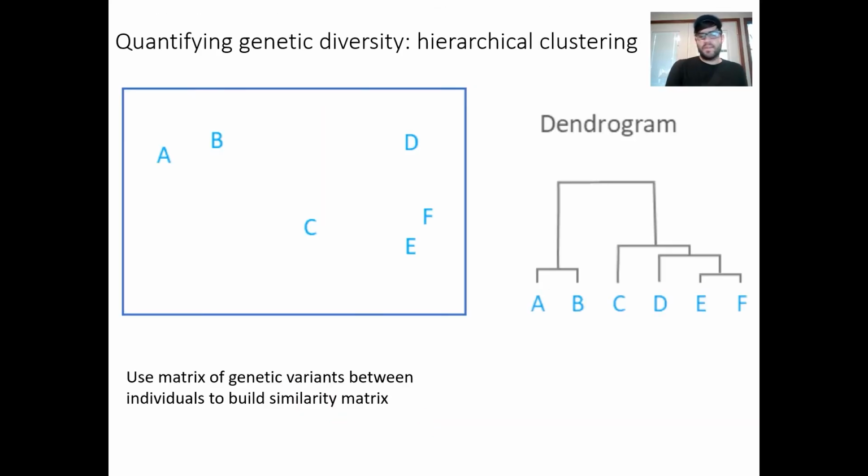And so there are a number of different approaches that we can do here. We can do a principal component analysis, which we will actually run in the notebook associated with this video. We can also run a hierarchical clustering, which we will also do in this video. The way this works is, let's say we have this grouping of data here, where we have these points A, B, C, D, E, and F in their dimensional space here.